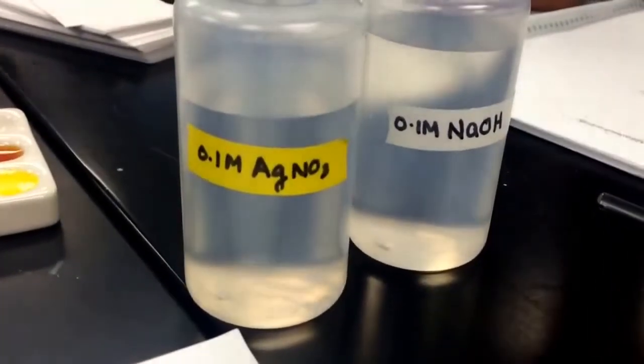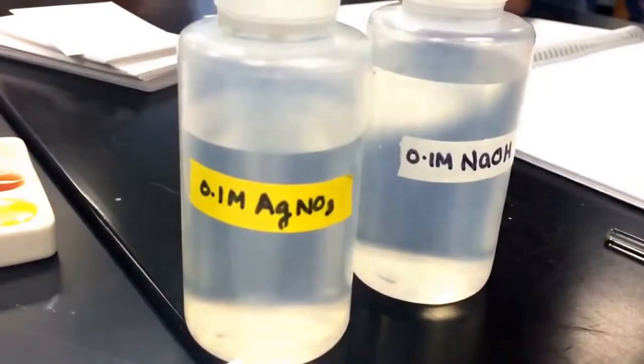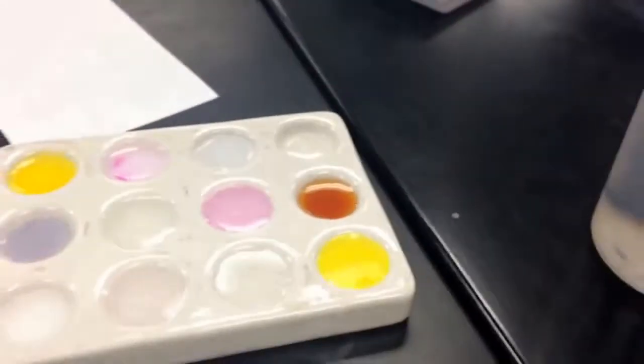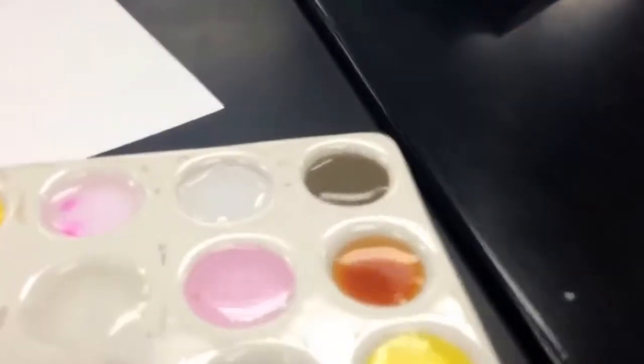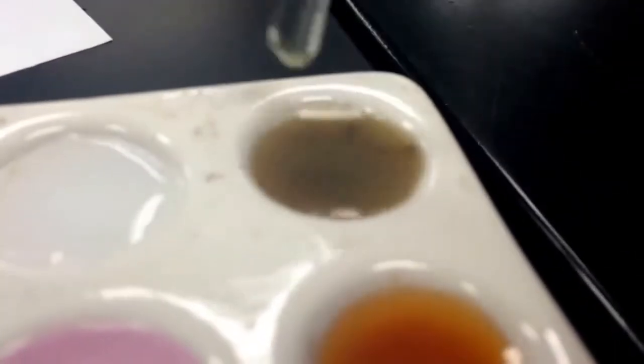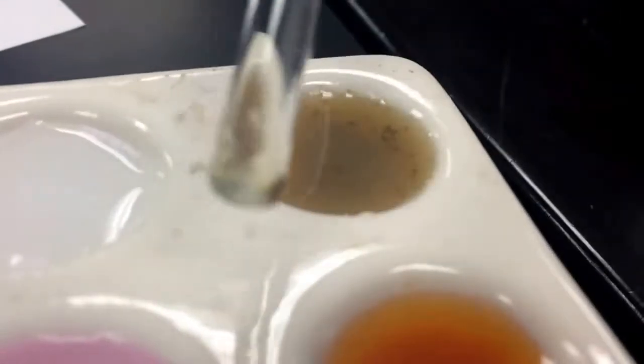Number 14 will be silver nitrate and sodium hydroxide. We're going to have to get a new tray after this because that's our last one. So here is our silver nitrate. And next is our sodium hydroxide. Oh, look at that, that's black. It looks like sand. Like dirty paint water. That's awesome. Yeah, it looks like mud on the bottom, but it's not mud, it's precipitate because obviously this isn't dirt, this is silver. I don't know if you can see this, there's a little bit of precipitate right there at the end of my stir. Alright, that's it.